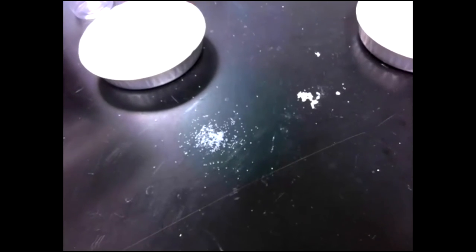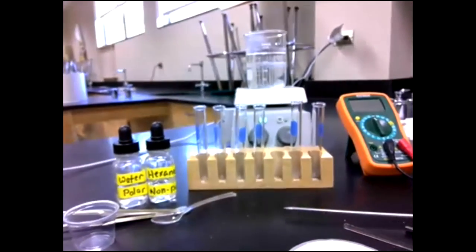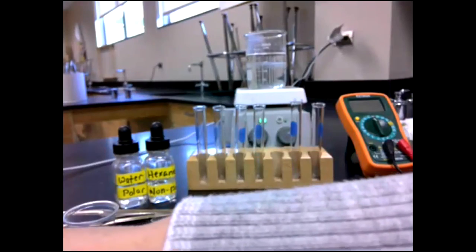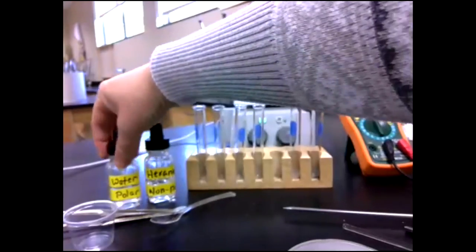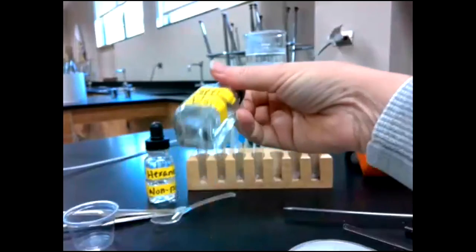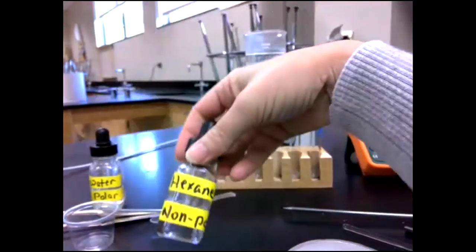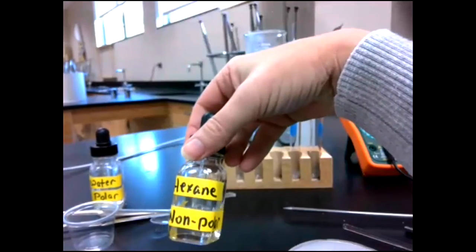Here's my document camera. Okay, so those are the two solids that we looked at through the microscope, and everyone just write down whatever observations as we talk about them. The next thing that we're gonna do is look at solubility, and we're gonna measure solubility of both solids, each of them in two different solvents. We're going to use water, which is just plain old water, a polar solvent, and that's on your chart. And then we're going to use hexane, which is a non-polar solvent, sort of like gasoline. Gasoline's probably the closest thing to that.